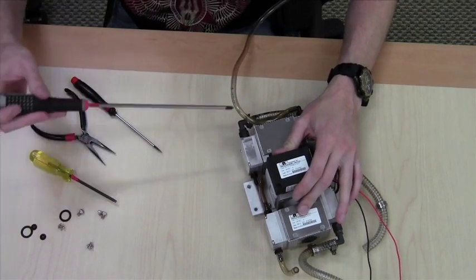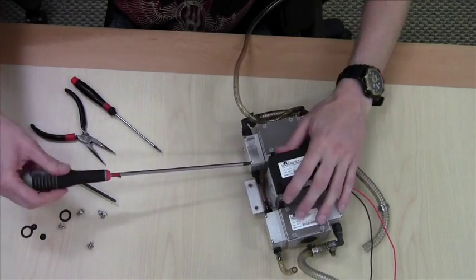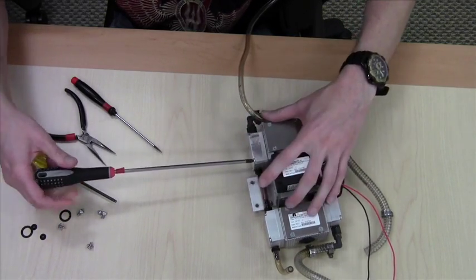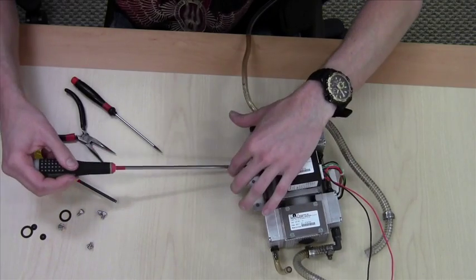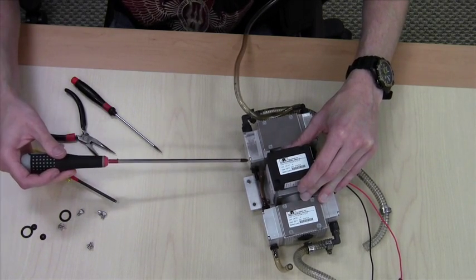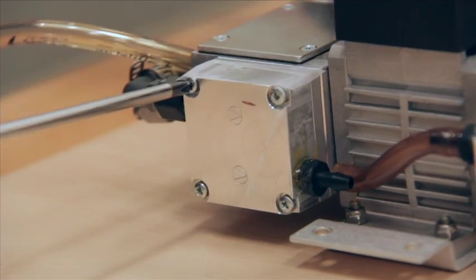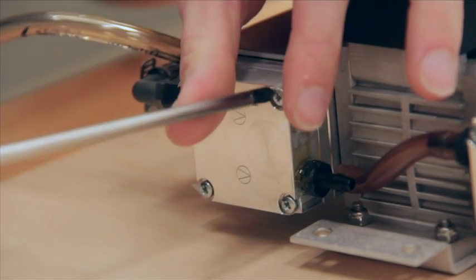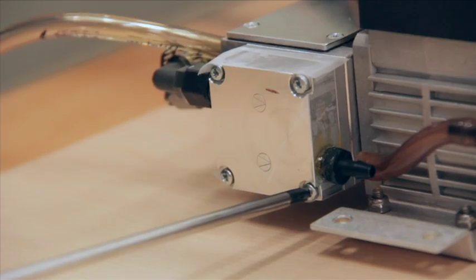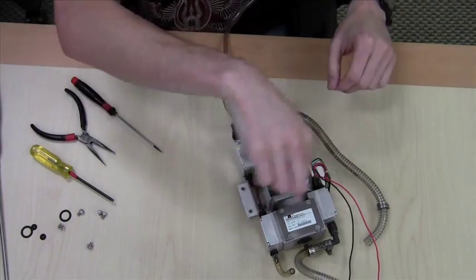When tightening the manifold screws, make sure you tighten them evenly. Don't torque one side all the way down at once. Once all four are snug, go ahead and tighten everything down good and tight.